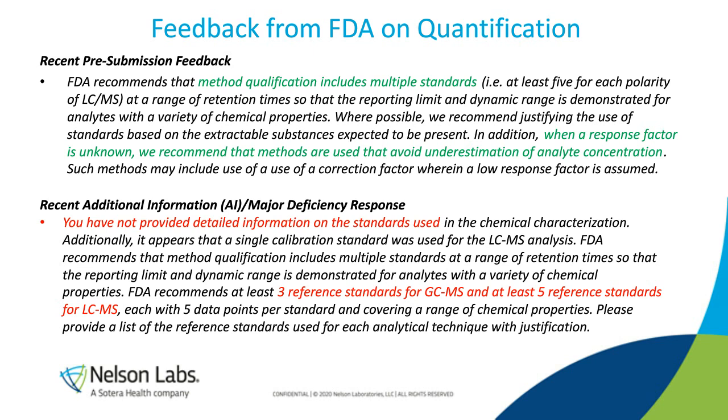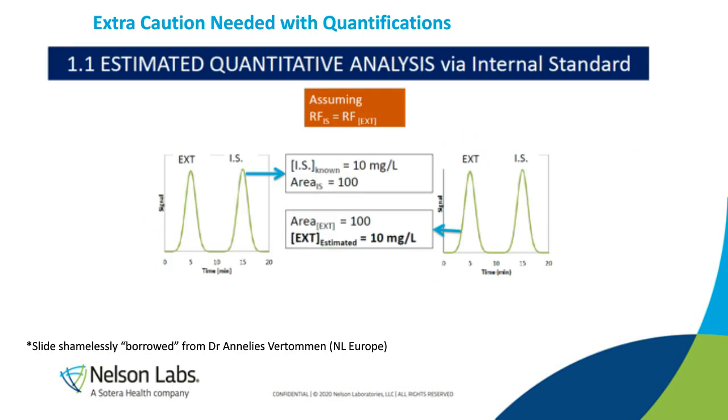So this is what they're asking for as part of the support for the quality of quantification. And just like how I explained a little bit about the identification process, to understand where this is coming from, we need to talk about how quantification can be done when we're doing these screening studies. So one way that this can be done, and this is something that I'm hearing from the FDA that they don't like, is the semi-quantification. When you screen, you anticipate seeing molecules that you've not measured before and that you don't have a calibration curve for. And so you have to estimate those concentrations somehow.